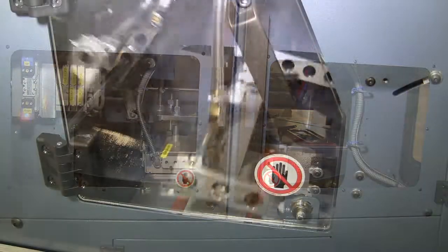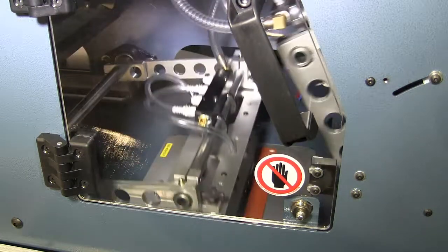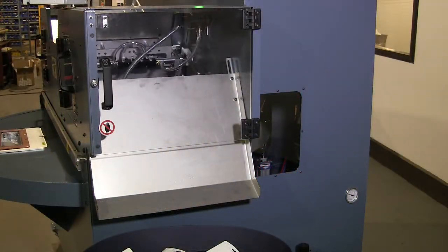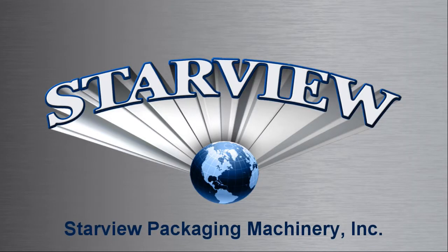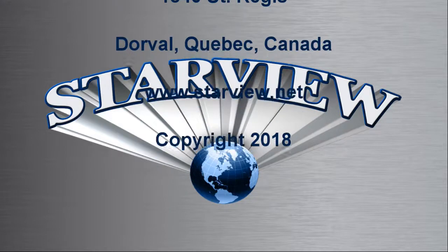These machines can be configured for conventional face seal carded blisters, full face blisters, and half clamshell styles for a wide range of products just by changing the heat seal tooling. Contact us to learn more about the Starview Advantage.